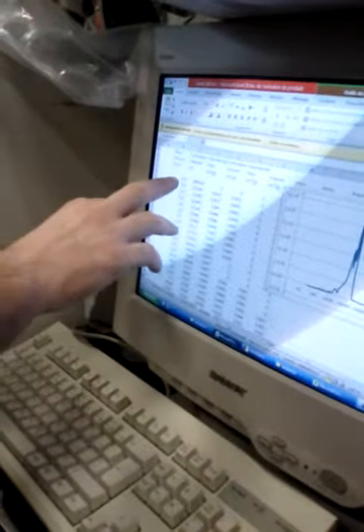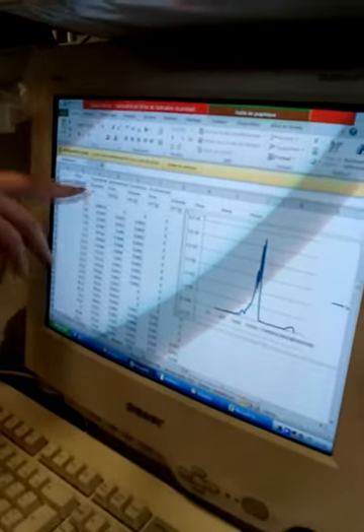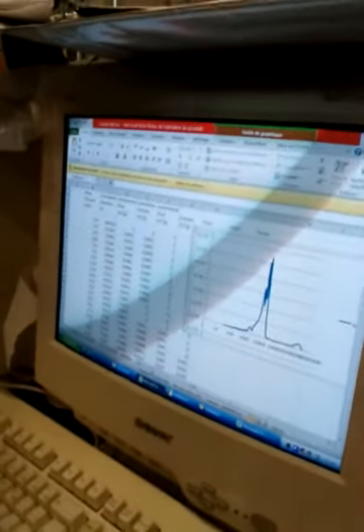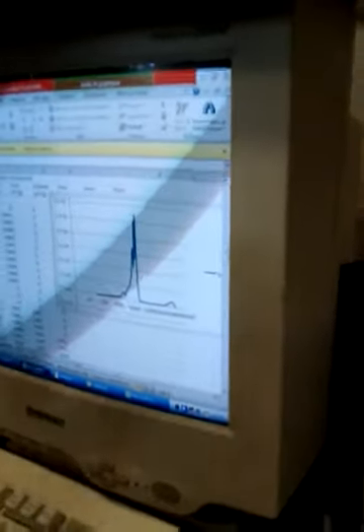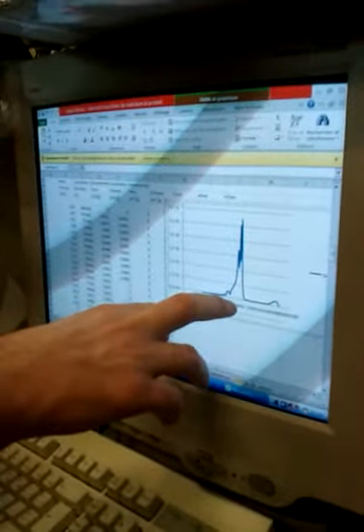Usually it's angstrom. It's a weird unit. Usually we prefer to use micrometers or nanometers. For example, I think it's about 1 micron, but I don't remember exactly.